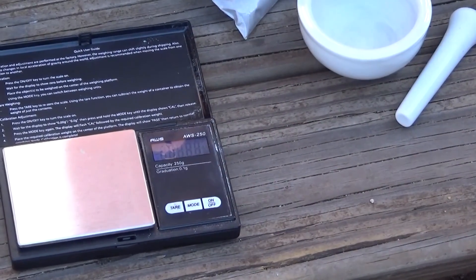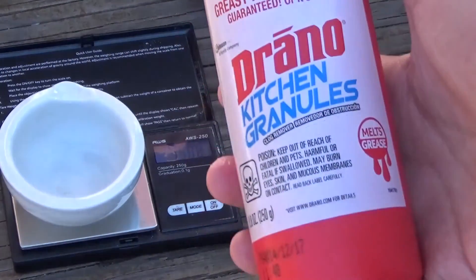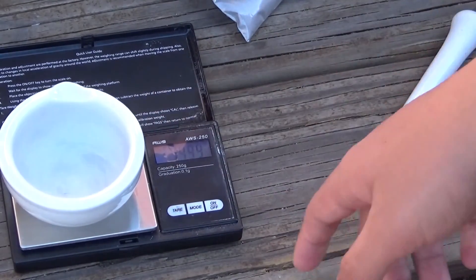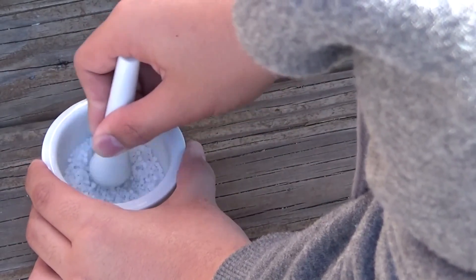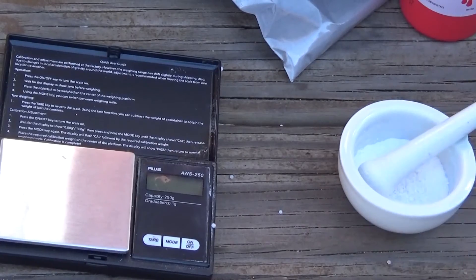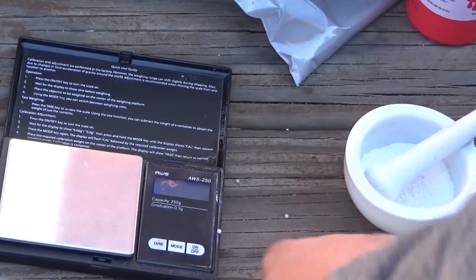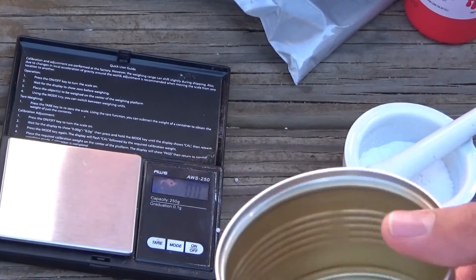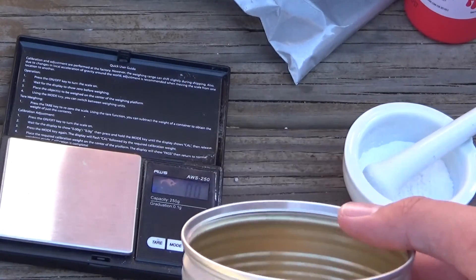First, we're going to weigh out eight grams of sodium hydroxide. This is commonly found as a drain cleaner, so it should be pretty easy to find. If not, you could probably order it online or make it yourself, which I might try later on. The container I'm going to be using today is this right here — I found it from an old Fritos cheese container. It appears to be aluminum. I recommend steel because the melting point is obviously higher. I have my doubts that this will actually work fine, but we'll try and see what happens.